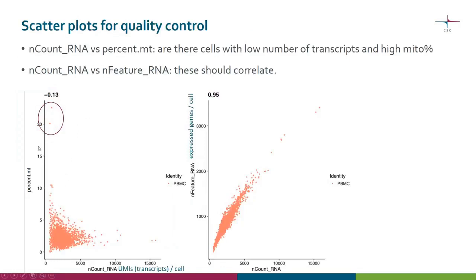There is also another plot using the same information but displayed as scatterplots. In the first one, we have the percentage of mitochondrial transcripts versus the number of transcripts — we want to see cells with a small total number of transcripts and a high mitochondrial percentage, which are likely dead cells. In the second scatterplot, we have the number of expressed genes per cell versus the number of transcripts per cell — these should show a relatively good correlation, as more detected genes should correspond to more UMIs.